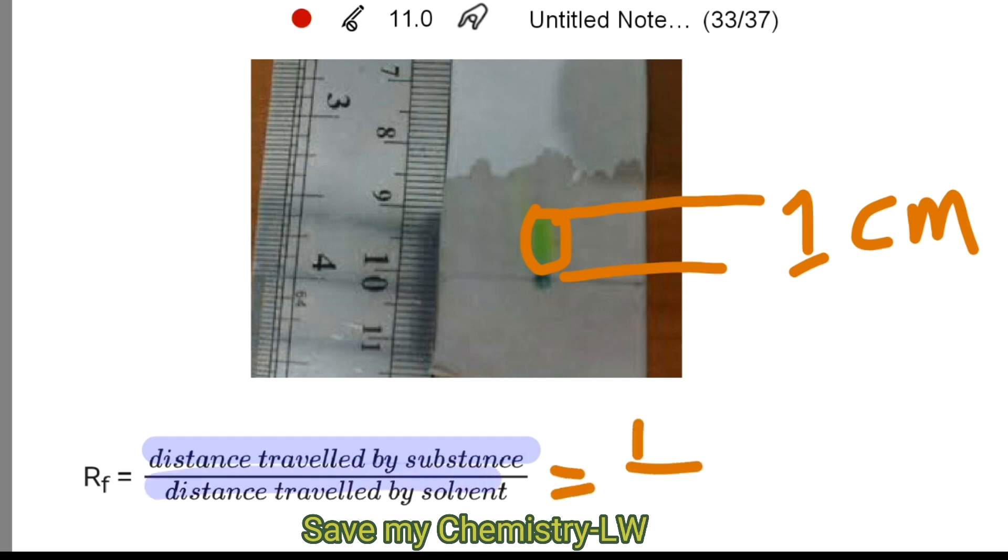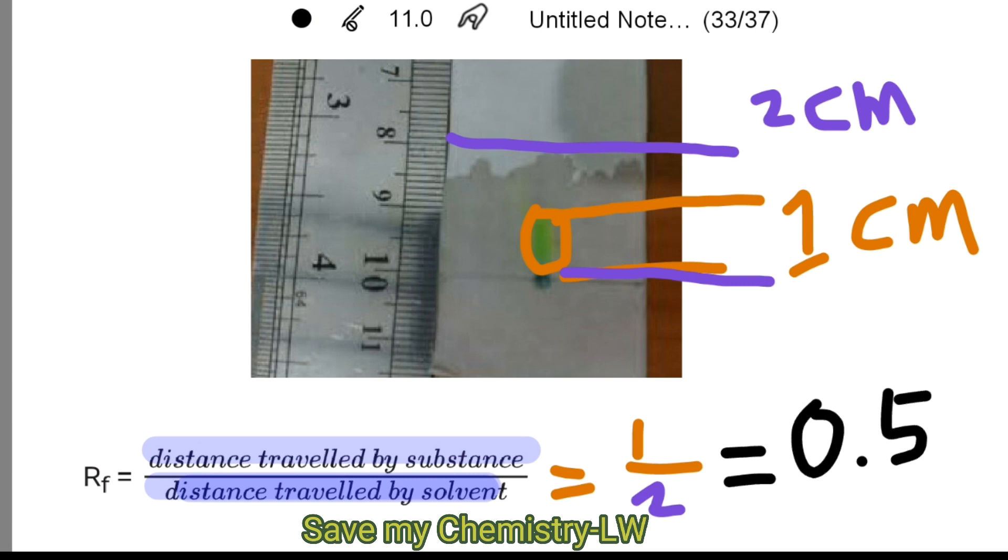And then we measure the distance traveled by solvent. Okay, see the purple color. We start from the bottom, bottom line, and then the top of the solvent ridge. There is 2 centimeters.